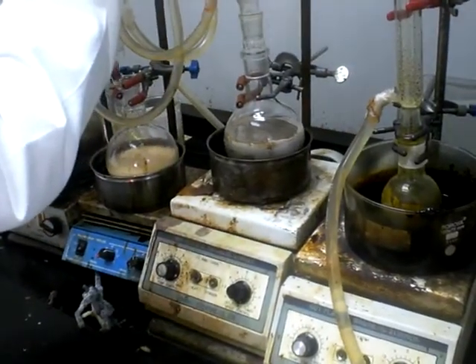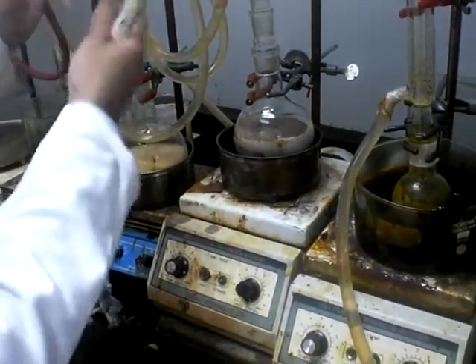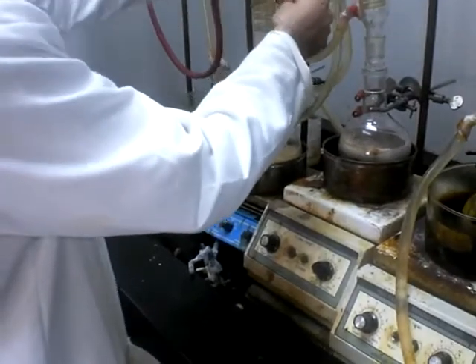Here we have two reactions, and our colleague takes samples from each reaction.